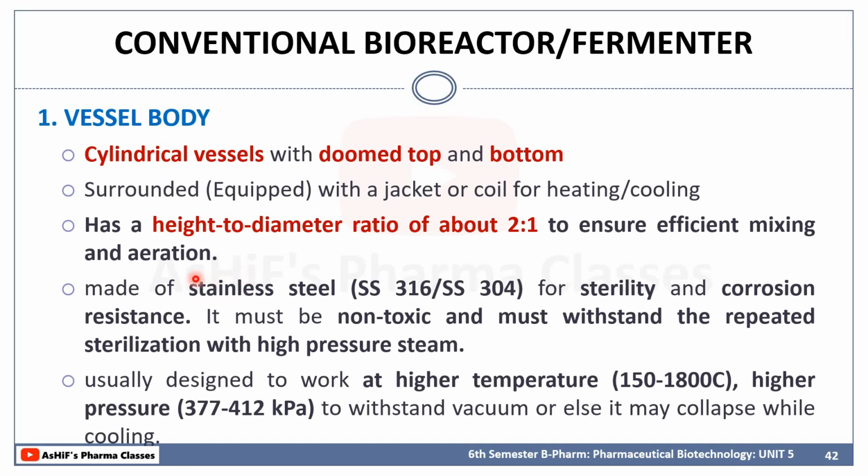And usually it should be made of stainless steel, for its sterility as well as corrosion resistance, and also it must be non-toxic, and it must withstand repeated sterilization with high pressure steam. It must withstand a high temperature of 150 degrees Celsius to 180 degrees Celsius, and a high pressure of 377 to 412 kilopascal. So that much resistance and strength should be there for the material used for manufacturing the vessel body.